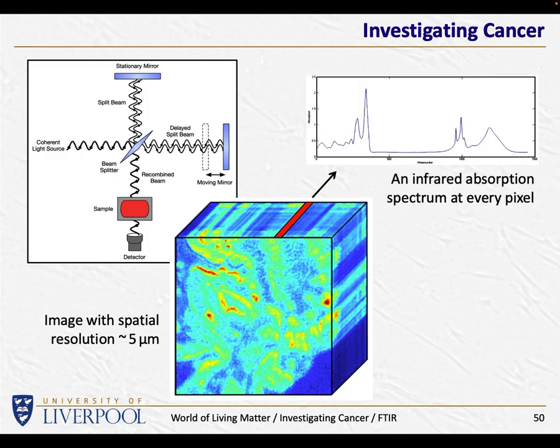We used a particular infrared spectral technique, which again, I'm not going to talk about the details, but it allowed us to image at lots of different frequencies. So this particular representation here is an artificial, a false color image of a particular piece of tissue. It might be, for instance, a few hundred microns or so in size, but we get an image at every wavelength in a whole spectrum of different infrared wavelengths. This particular spectrometer allows us to do that.